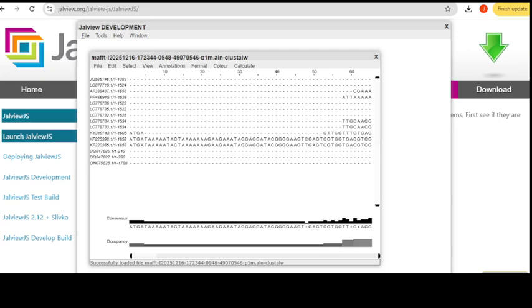So now what you see here is the consensus. It gave you your sequence, what it's supposed to be, the overall sequence that the program prefers to fetch from your alignment. In the alignment, there are differences from each other as well.